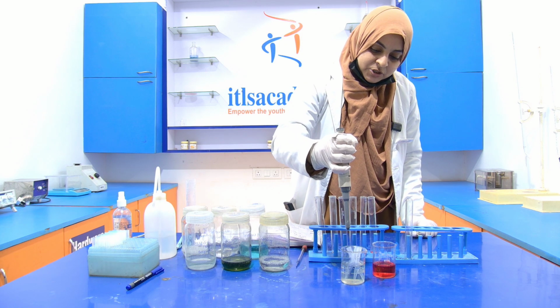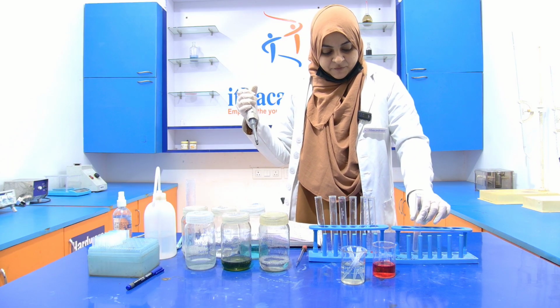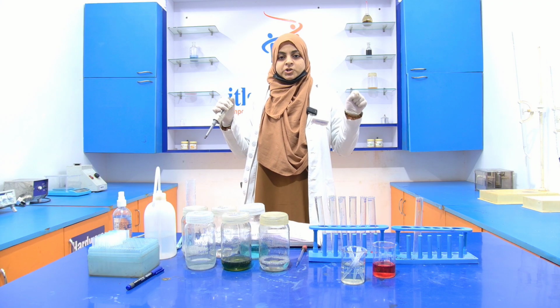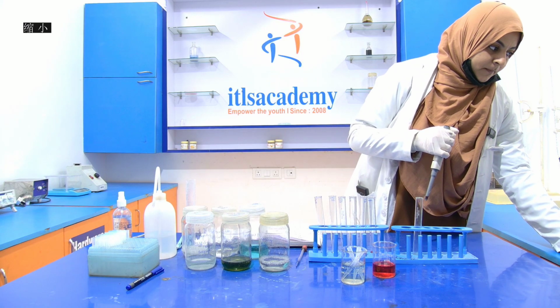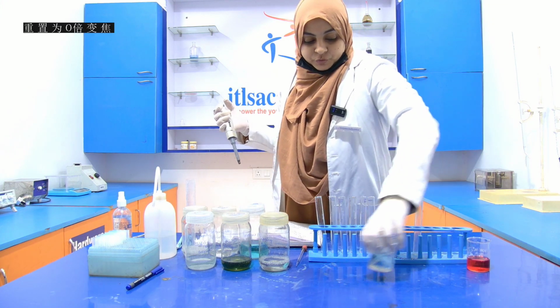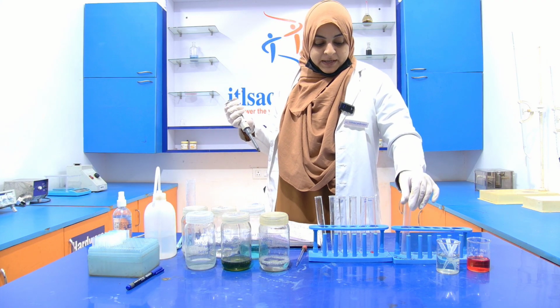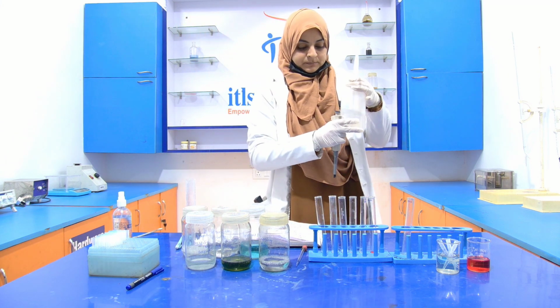Now again, change the tip. Now after that, we have to make up the volume to 1 ml in each test tube. For making up the volume to 1 ml, what we have to do is add different amounts of distilled water into each test tube. This is our distilled water.